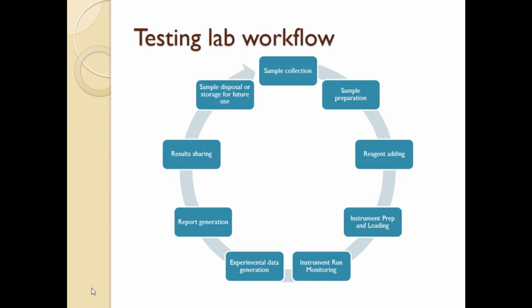The results can be shared then interdepartmentally. Different departments can get access to the LIMS system depending on their access control, and they can view the reports on the system as they're generated. It can also look at how the sample is disposed, where it's disposed, the quantities disposed, as well as any retained samples that are taken and how they're stored and recorded. So the workflow is recorded, and the audit trail is maintained right from sample receipt to sample disposal.